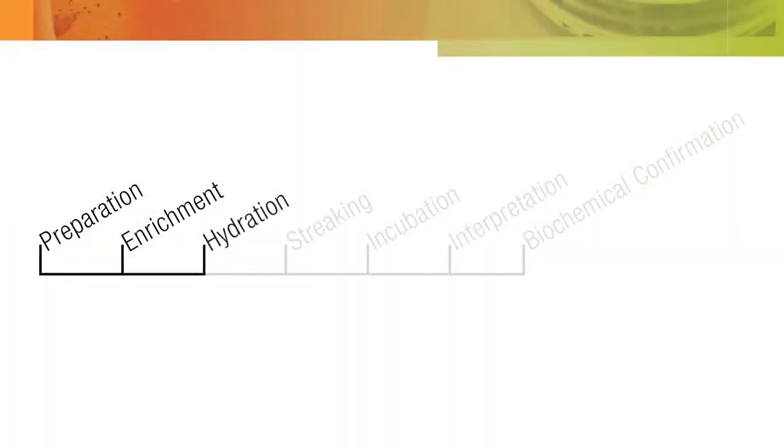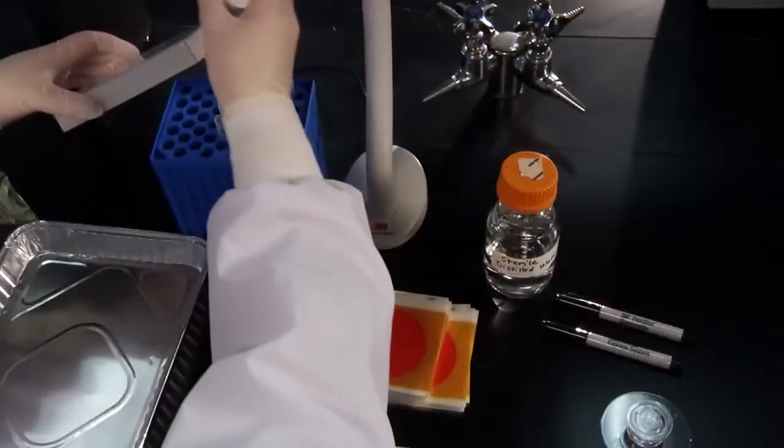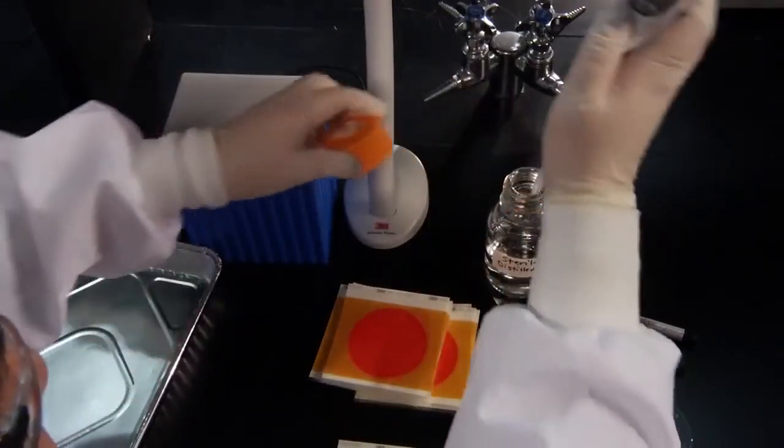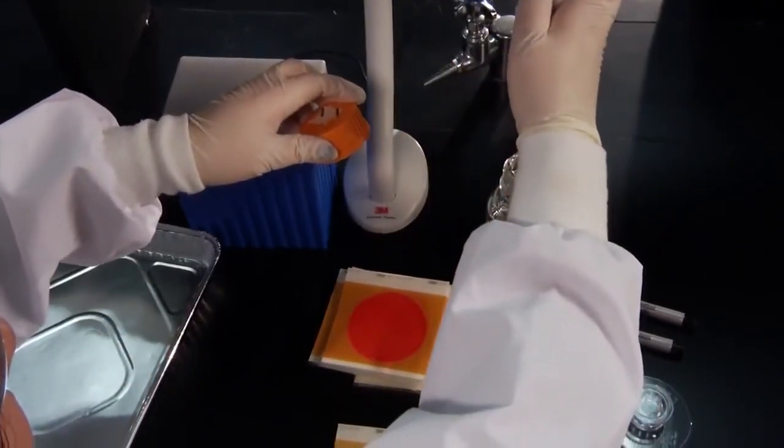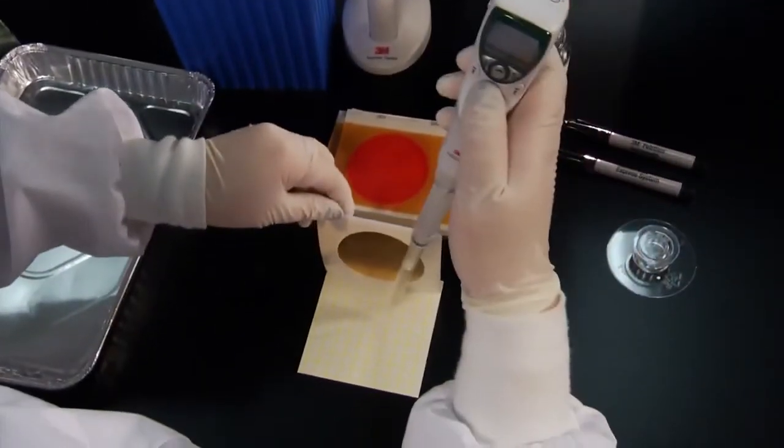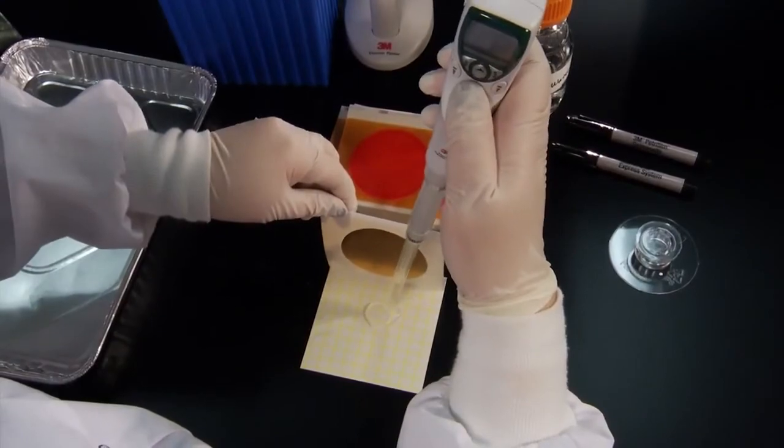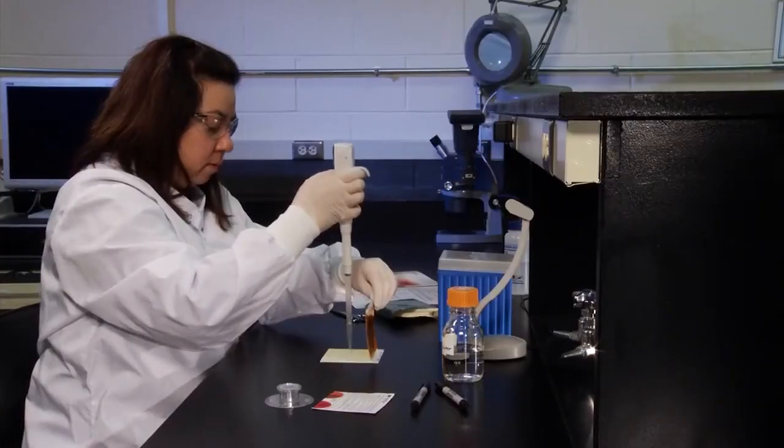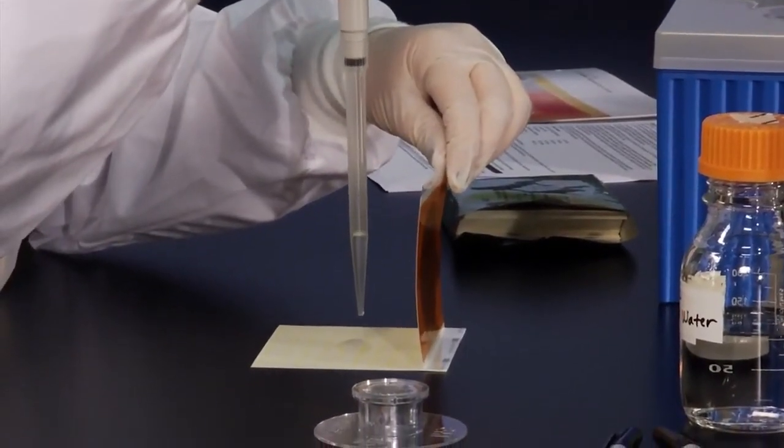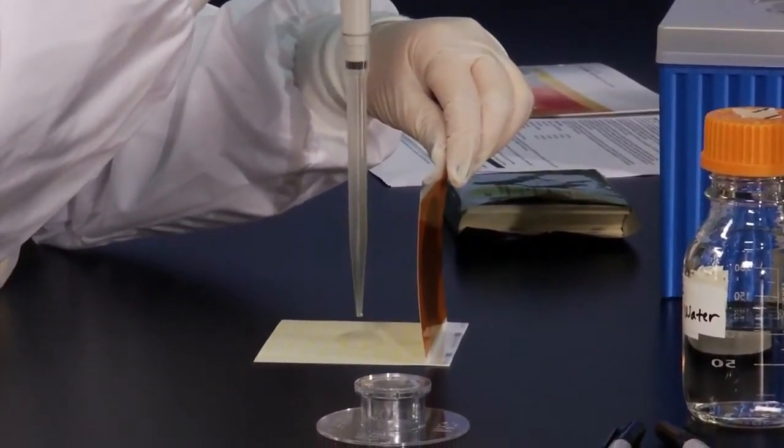The next step is the hydration procedure. To hydrate the 3M Petrifilm Salmonella Express Plate, place the plate on a flat level surface. Lift the top film, and with the pipette held vertically, dispense 2.0 milliliters of the prescribed sterile diluent onto the center of the bottom film. Do not close the top film before dispensing the entire 2.0 milliliter volume.